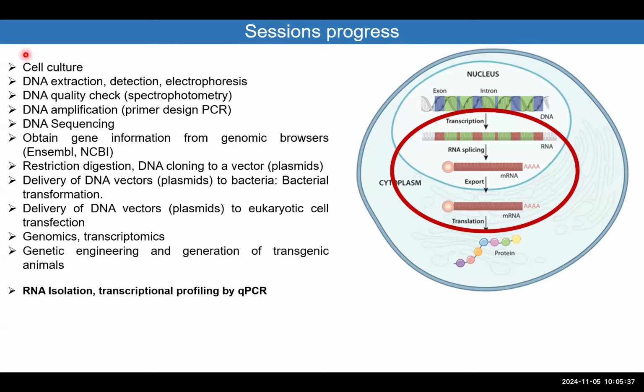Now, as I said, these 2 lectures will be discussing how we isolate RNA again. I will refresh your memory again, and then we will start describing the qPCR. So most of our discussions will be from the step of transcription to the end of the translation, to the beginning of the translation, sorry.